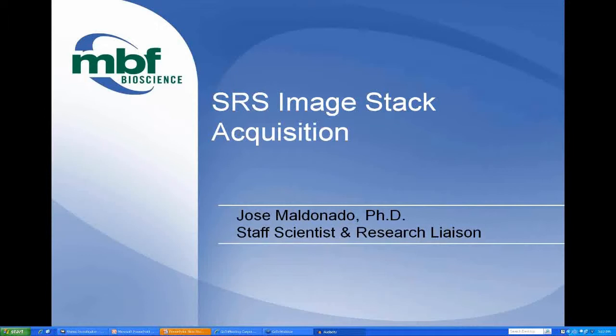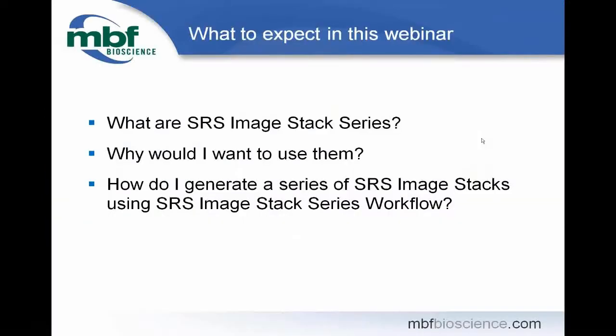The goal of this webinar is to highlight the benefits, uses, and features of the SRS Image Stack acquisition workflow, as well as to demonstrate its application. Broadly speaking, we will be considering the following today. What are SRS Image Stack series? Why would I want to use them? How do I generate a series of SRS image stacks using the SRS Image Stack series workflow?